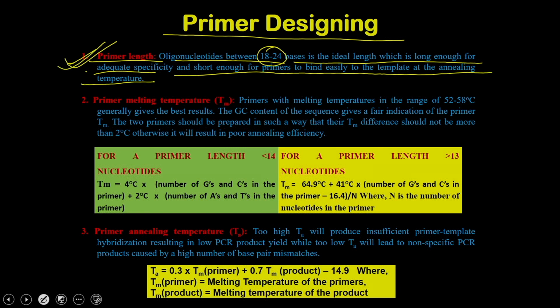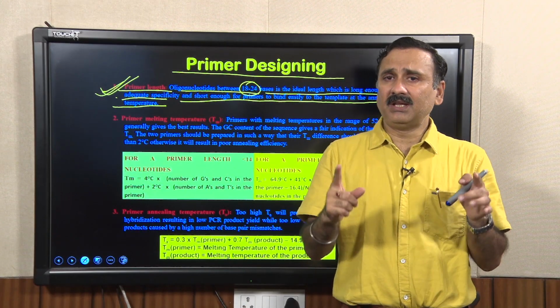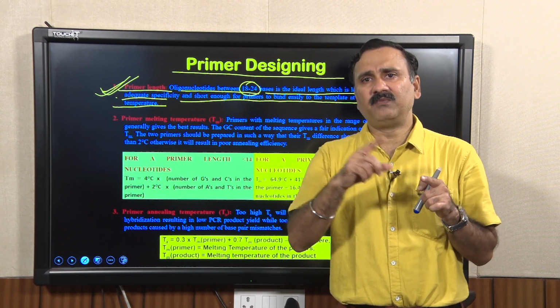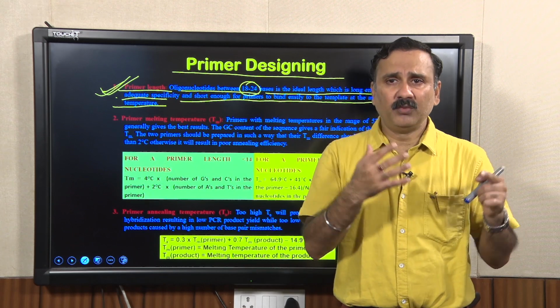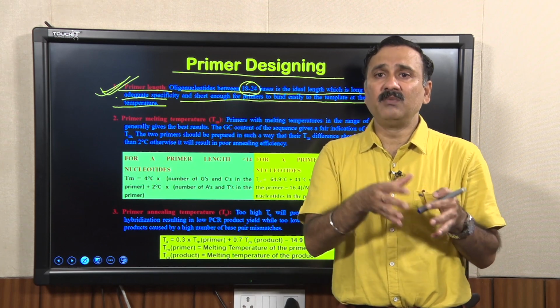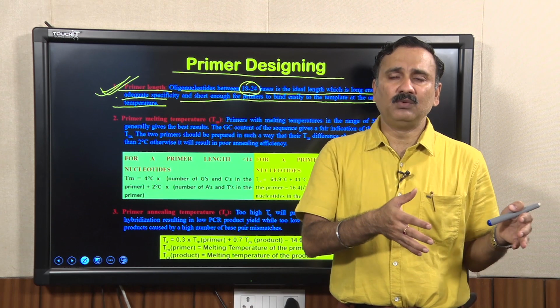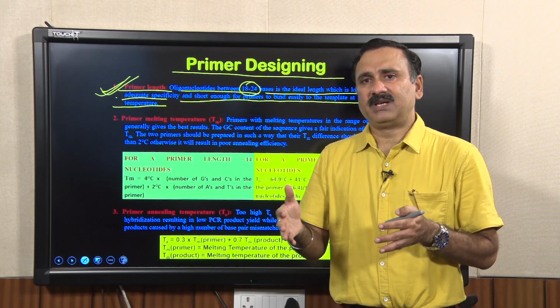Very short primers, like 12 to 16 base pairs, are going to lack specificity, because a very small stretch of DNA could find multiple regions within the target DNA, or if you are using genomic DNA, the primer could bind to multiple locations. That would give you non-specific products, or it may not give you amplification at all.